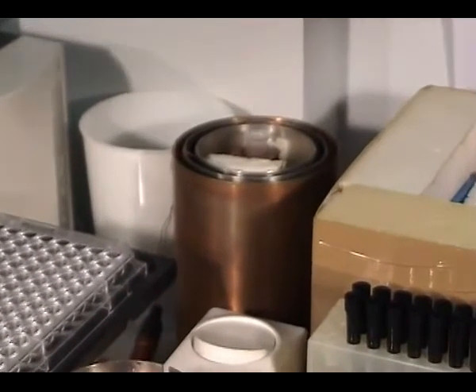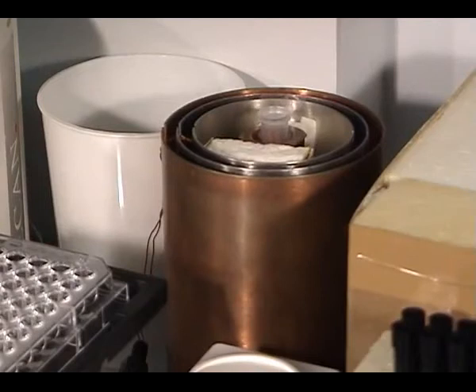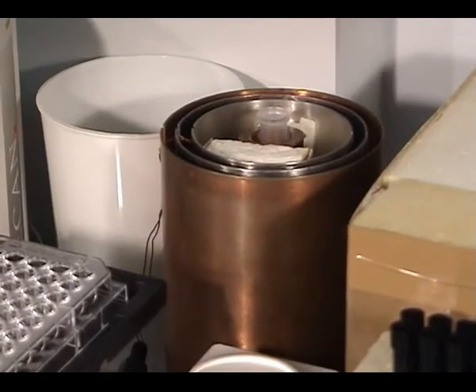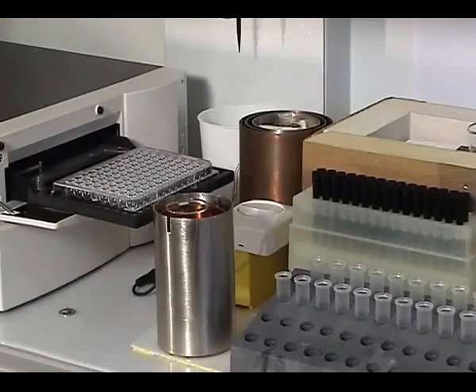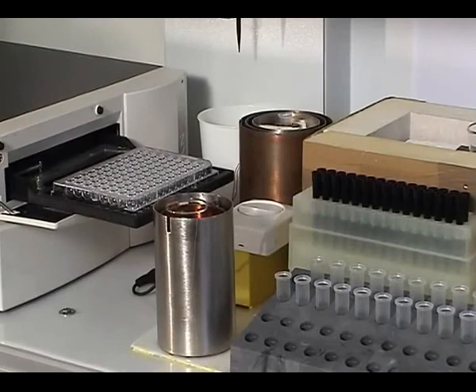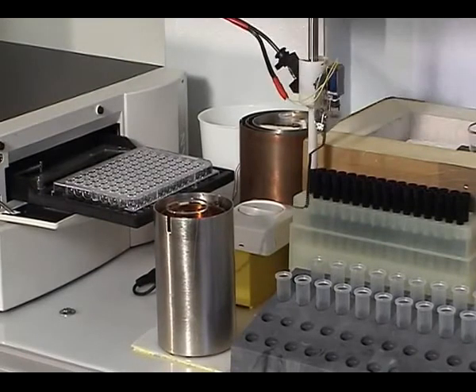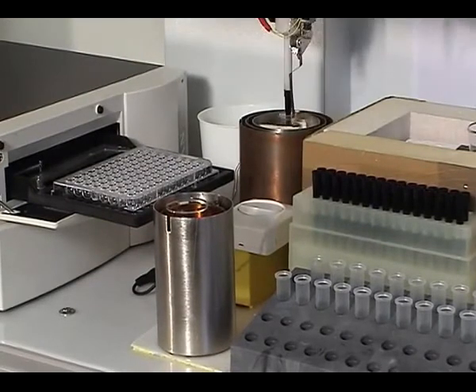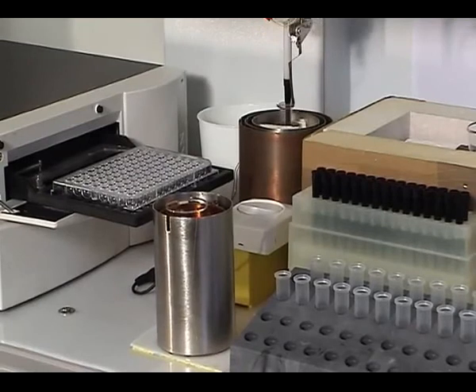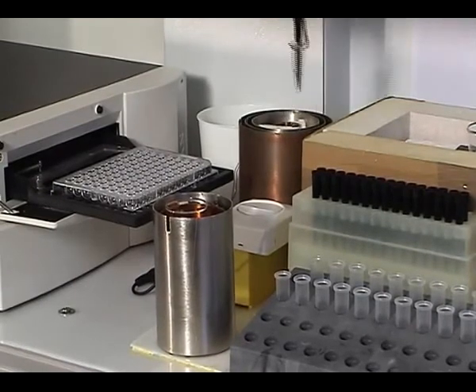And then during 5 minutes, this tube will be submitted to the signal. We have obviously skipped the 5 minutes and the machine will now take another tip, get this tube with the informed water, and put it back in place.